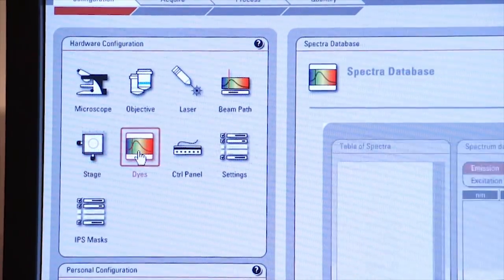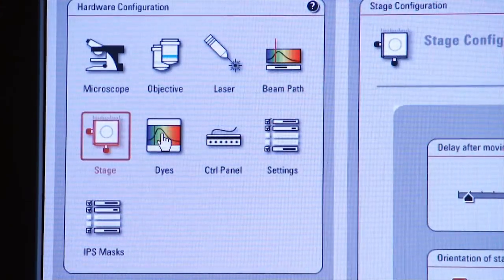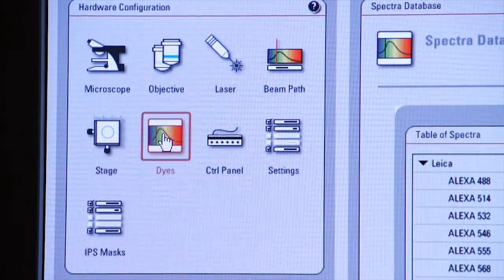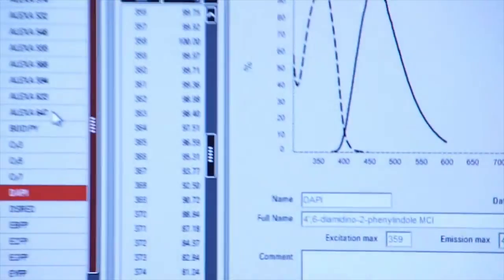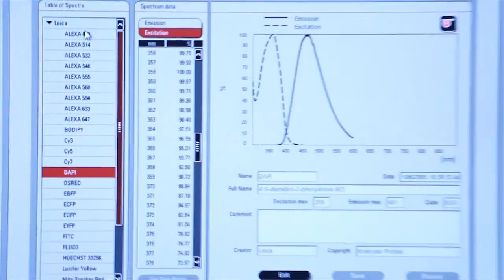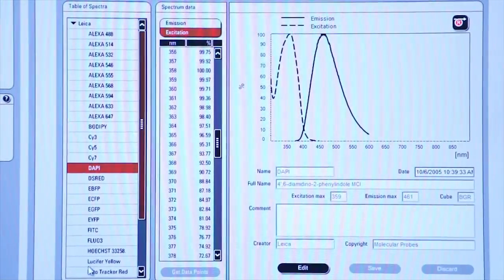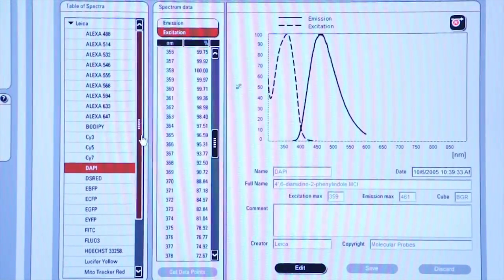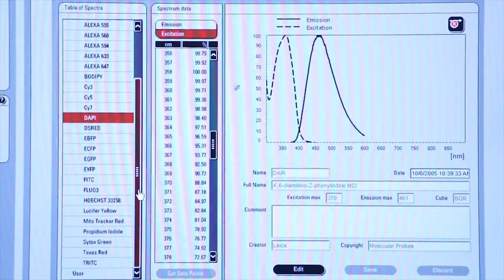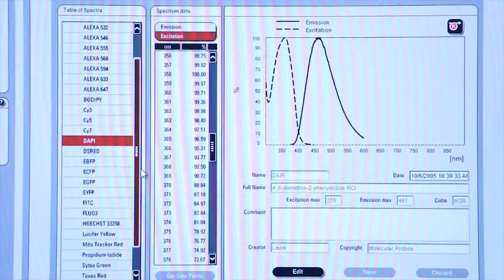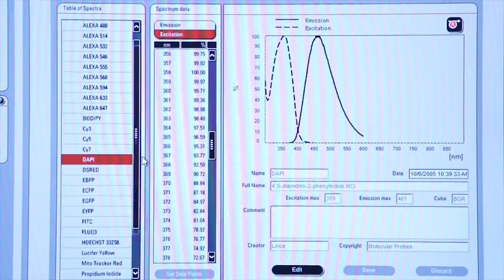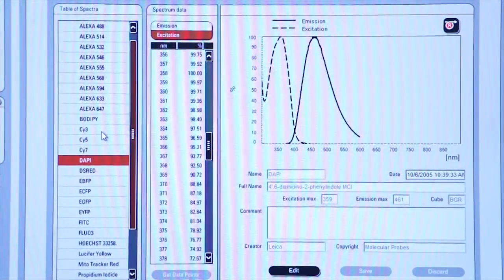However, the dyes icon is very important. If you click on that icon, a new screen comes up that shows you all of the different dyes that are available. We can add to this list of dyes also. If there's a fluorophore you're interested in working with, we can add it to this list.